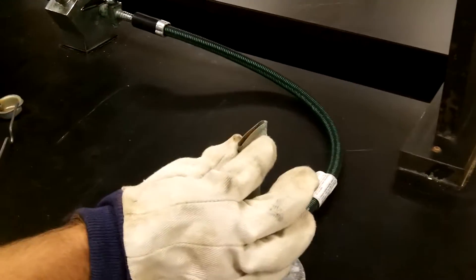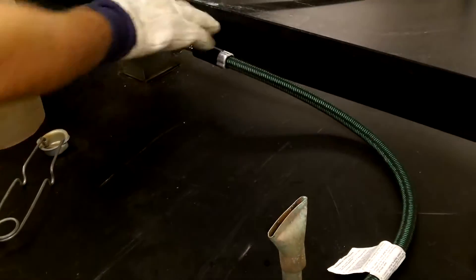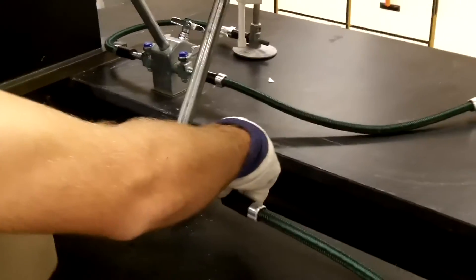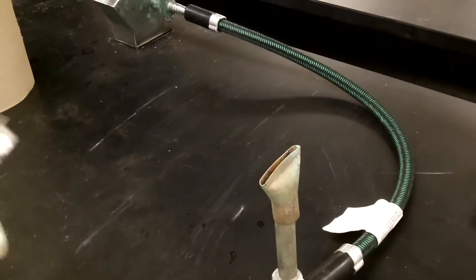To bend the glass tubing, put a wing tip on the end of the Bunsen burner. Then, turn on the gas, make sure the gas is coming out, and light it with a striker.